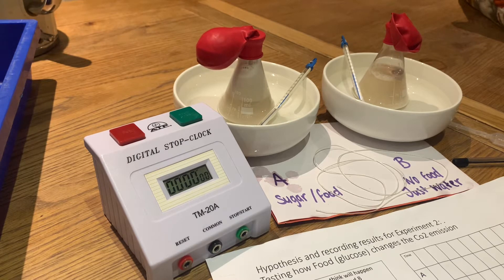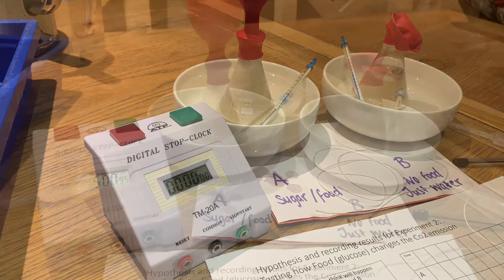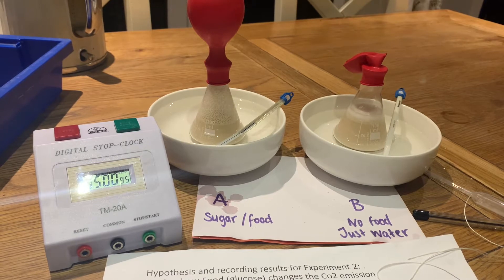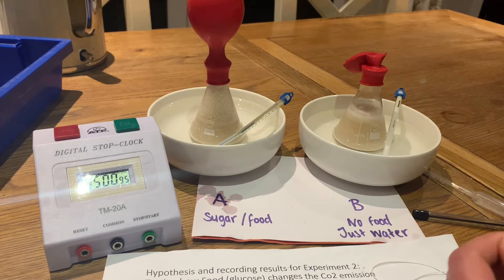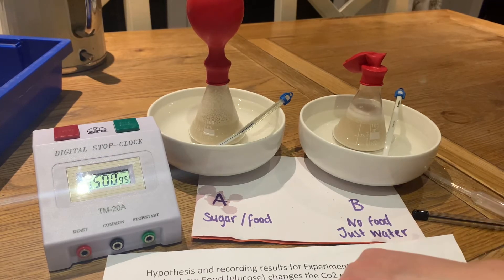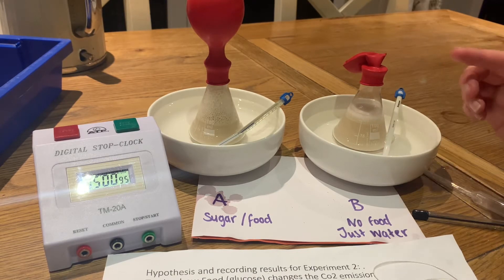I'm timing and observing what is happening. We can already see that flask A is already activating and the balloon is blowing up. At five minutes, A has done really well. Flask B is starting to foam, so I think it will produce a gas eventually.